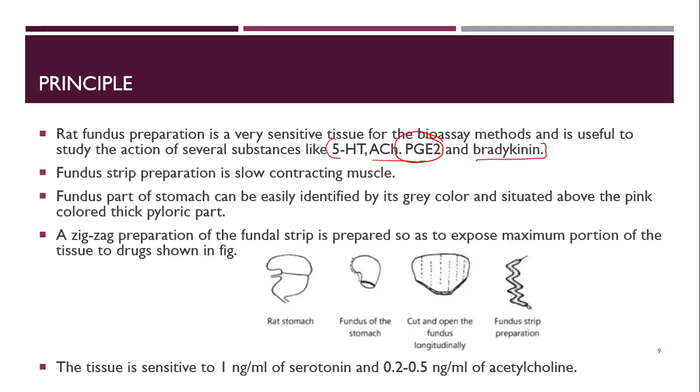Okay, so fundus strip preparation is slow contracting muscle, so when we talk about the time cycle, the time which is allowed for the drug to remain in contact with the tissue will be more, that is, the contact time will be more.